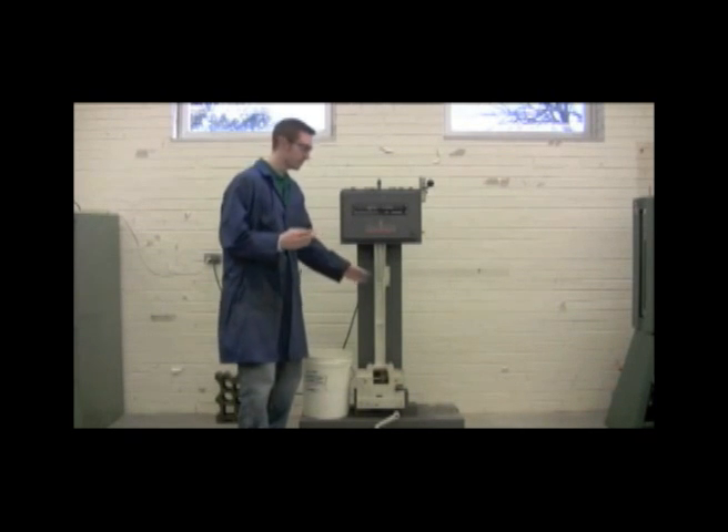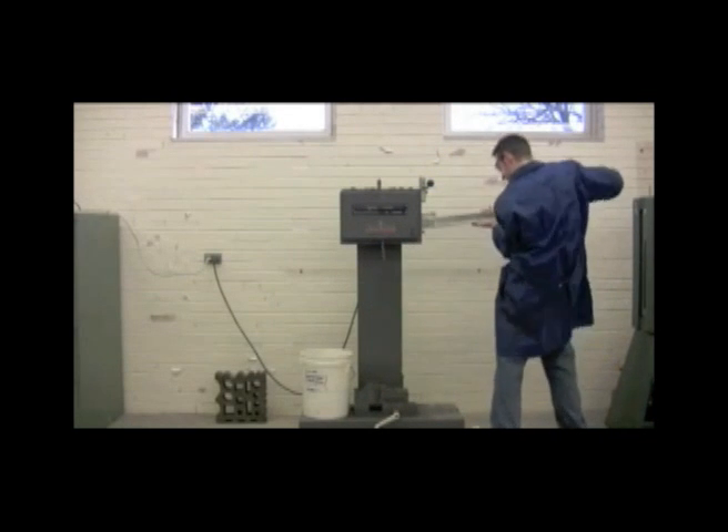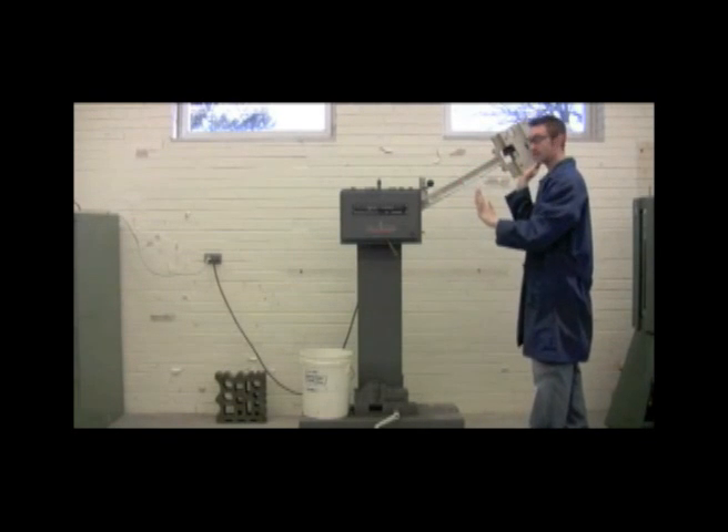The first thing we want to do is load our hammer. We're going to pull back and lift up — it's pretty heavy — but now that you've heard that noise, you know it's latched in the machine correctly.